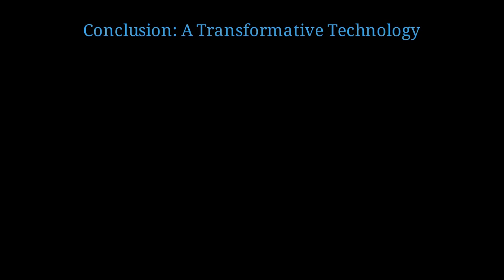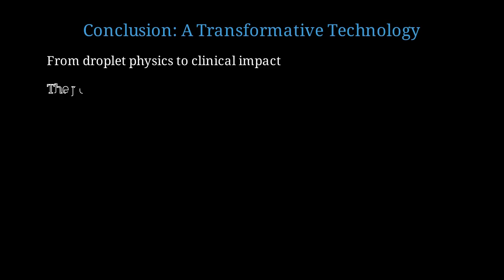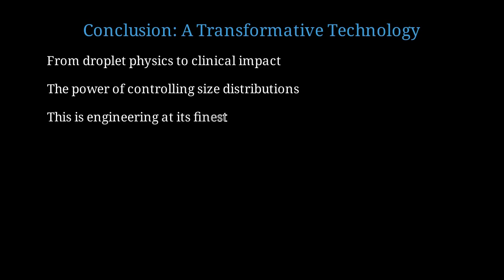Microfluidic generation of monodisperse emulsions represents a transformative technology that bridges fundamental physics, engineering design, and practical applications across diverse fields. We've seen how understanding the fundamental physics of droplet formation enables precise engineering that leads to real clinical and commercial impact. The power lies in controlling something as seemingly simple as size distributions, which cascades into dramatic improvements in performance. This is engineering at its finest, taking fundamental scientific principles and translating them into practical solutions that improve human health, food quality, and materials performance.